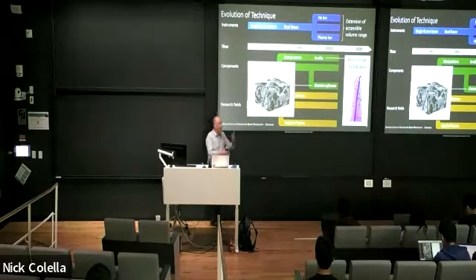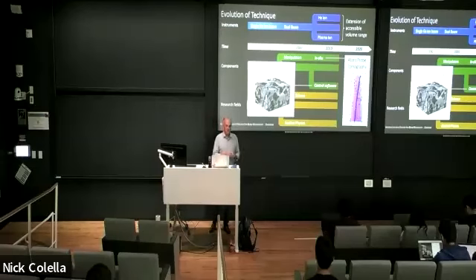Also, the software has evolved more and more. We became more and more sophisticated. And so nowadays we can do three-dimensional imaging with that technique. We can run the instrument over days and record a lot of data and get three-dimensional information about the material.